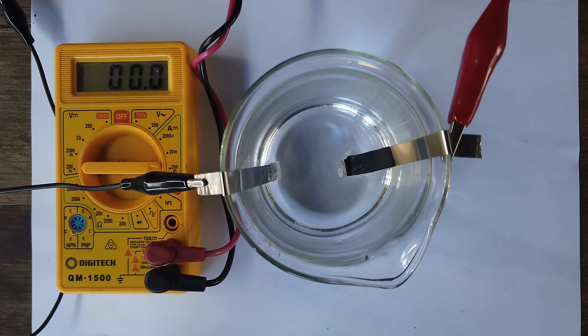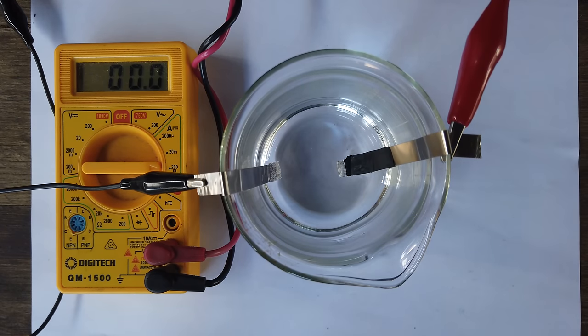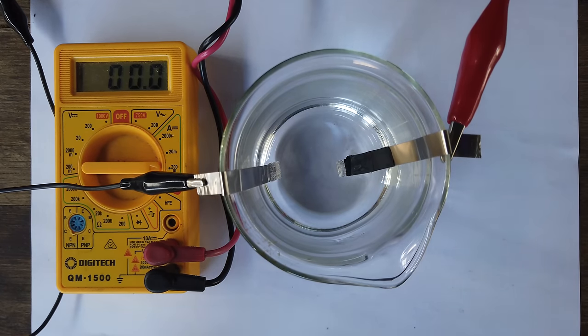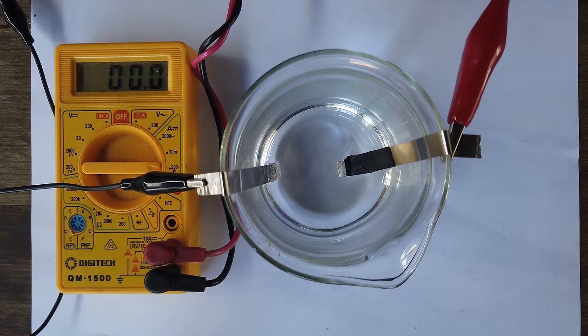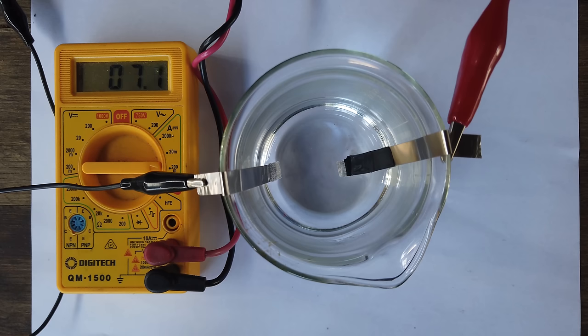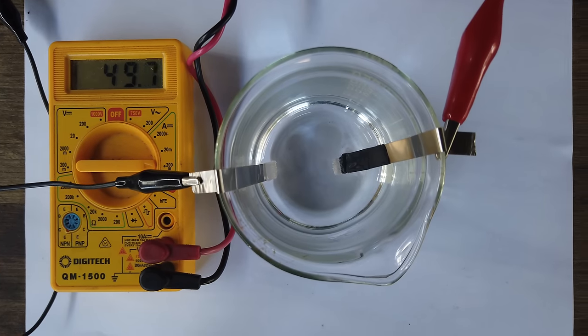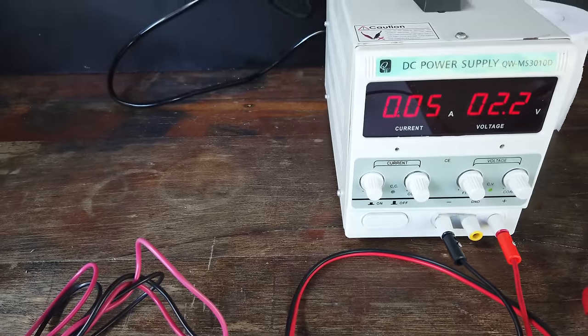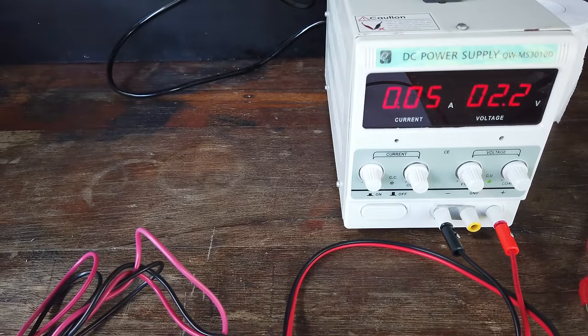This is the setup here. I have our nickel cathode that we're going to be using for all of the tests. We're using nickel as the anode for our first little experiment. I'm measuring current here, and I'm going to slowly increase the voltage until we see 50 milliamps flowing. About 50 milliamps flowing through the cell, and it takes about 2.2 volts to get that to happen on our nickel anode.